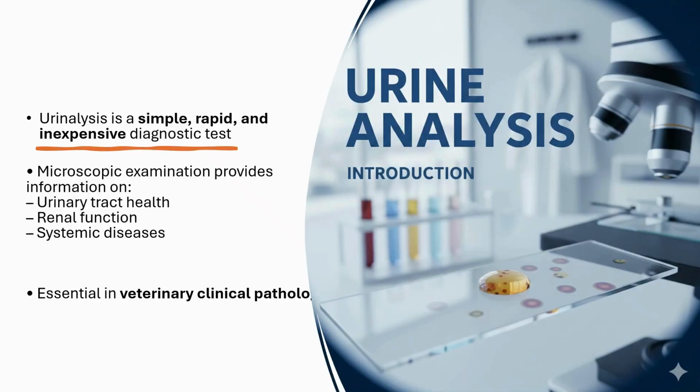Urine analysis is one of the most valuable, inexpensive, and informative diagnostic tests in veterinary medicine. Among its components, microscopic examination of urine sediment provides critical insight into diseases of the urinary tract, kidneys, and even systemic conditions. In this video, we will explore how to perform microscopic examination of urine in animals, what structures can be identified, and how to interpret them clinically.